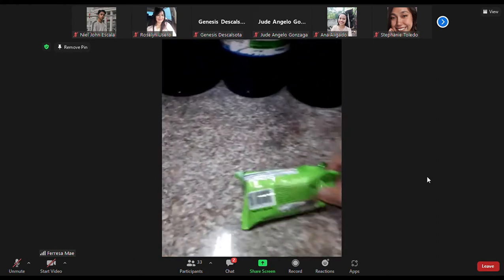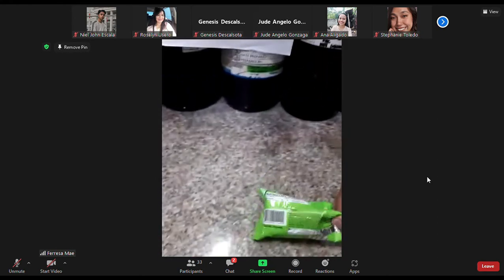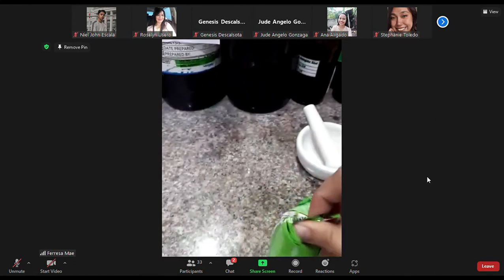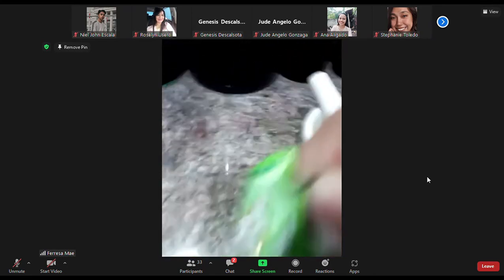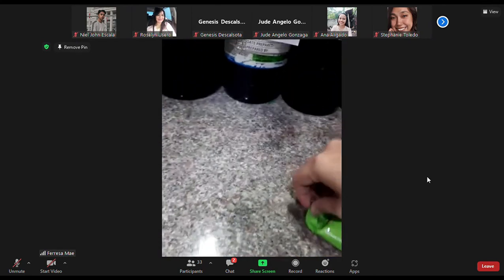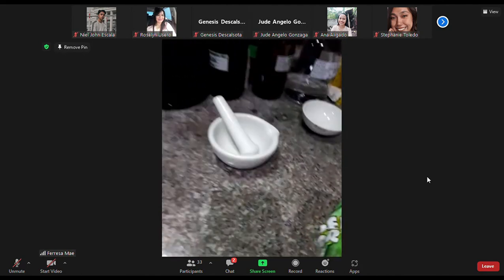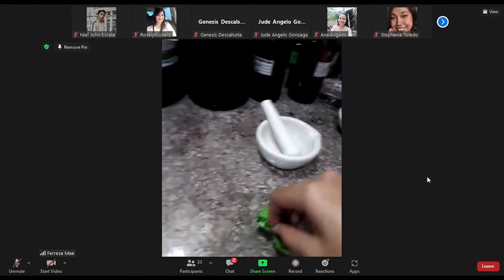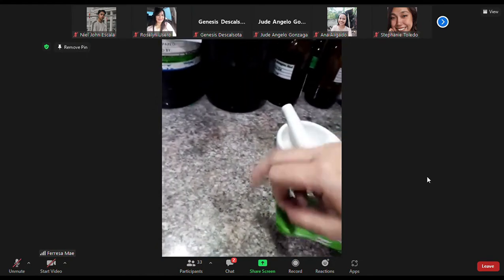Before ka mag-moisture, ang sample kagina na-homogenize na kay powdered form na siya. So may isa man ta ka sample karon nga cookies na homogenize naman. Make sure magkuha ka moisture, homogenize kita sang sample para accurate ang inyo nga makuha nga result.